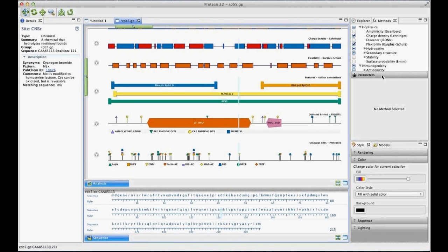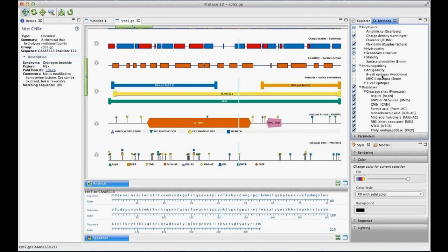So that brings me to the end of the analysis view section. If you have any questions about that, I would be happy to answer them. Yes, we do have a couple questions.